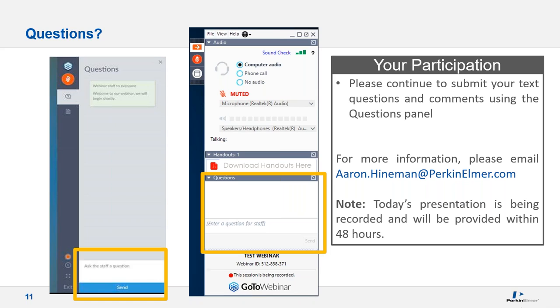This is a good question. Can you provide information on samples prepared with high concentrates of lithium borates, just fused beads? Ooh, I've never done those. We do have an application note about looking at lithium borate samples or different types of fusion samples.